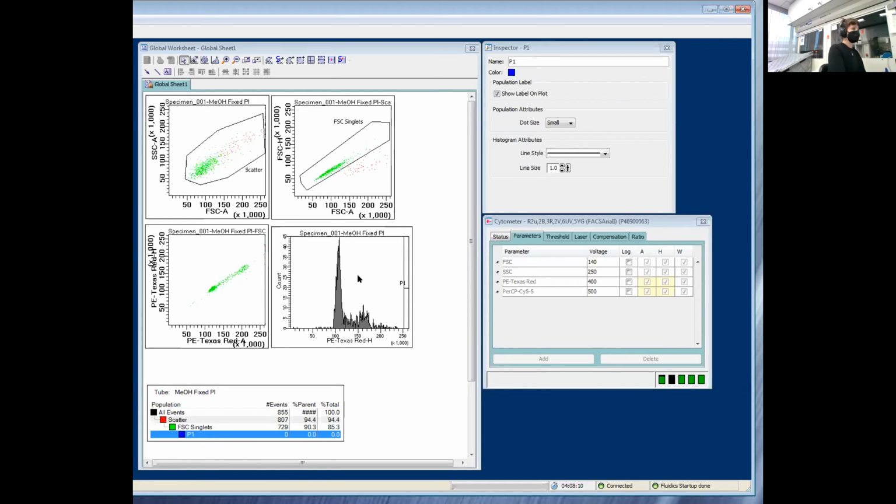Now, you might be curious and want to know where to set your G1 peak. Typically, you set that right around 50 on a BD instrument, and that's the lower or the first quarter of the plot. This gives you room to see the distribution of your G1, S phase, and G2, and it also allows you some room to see any potential aneuploid cells.